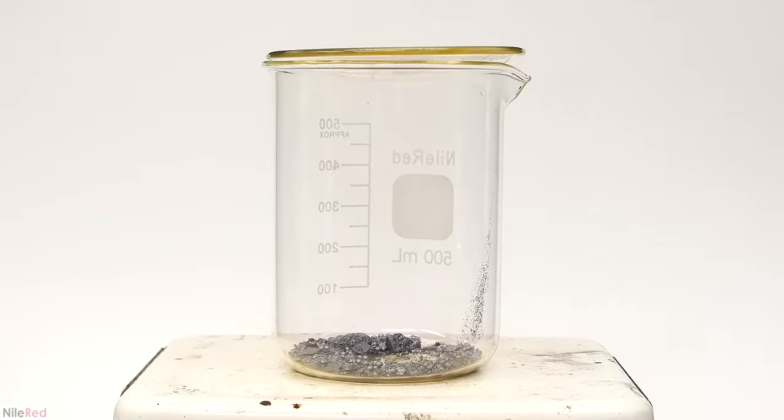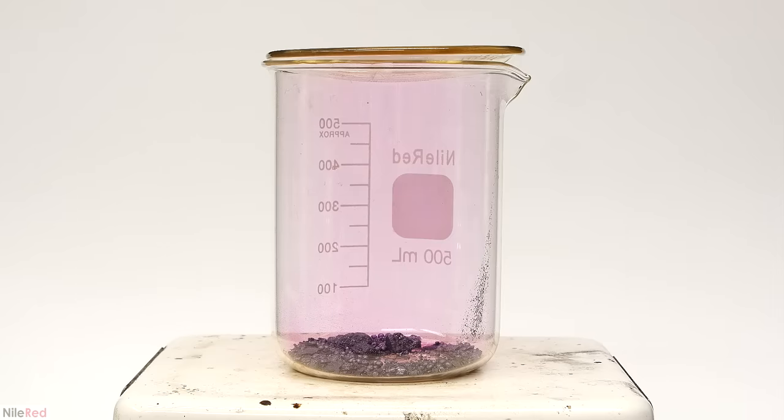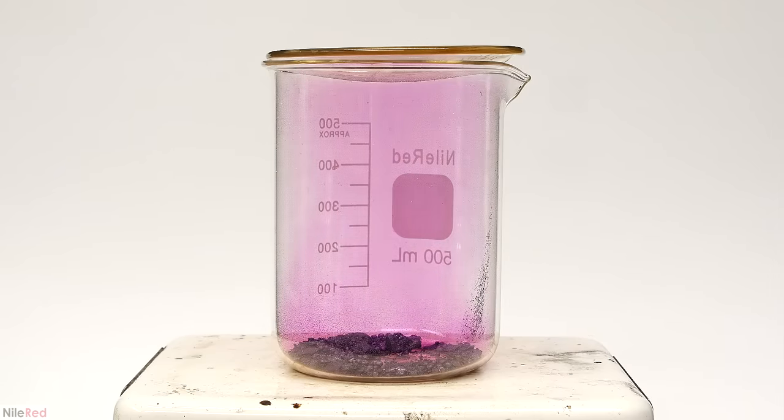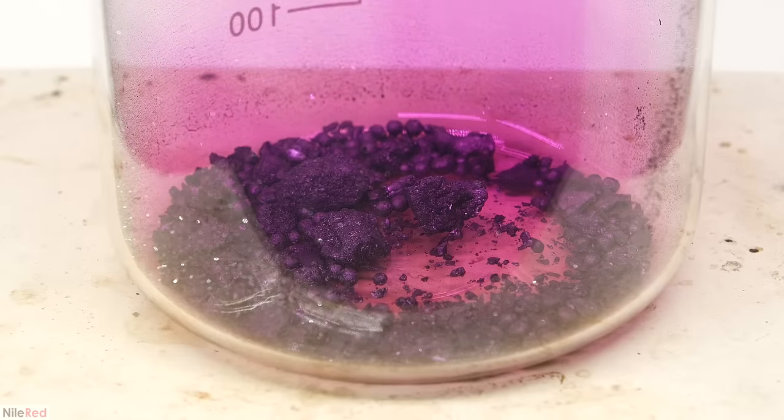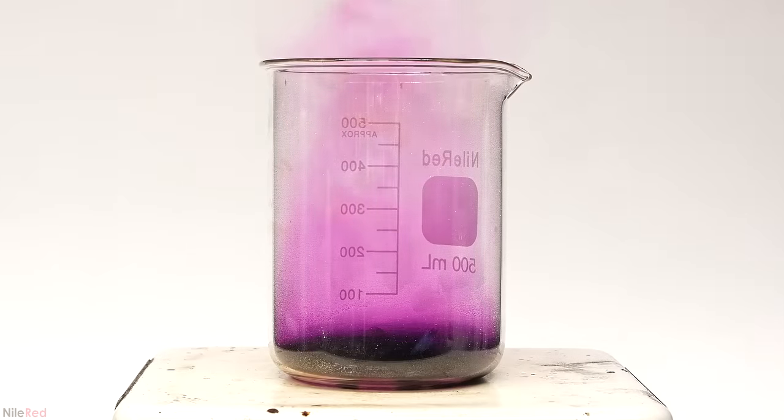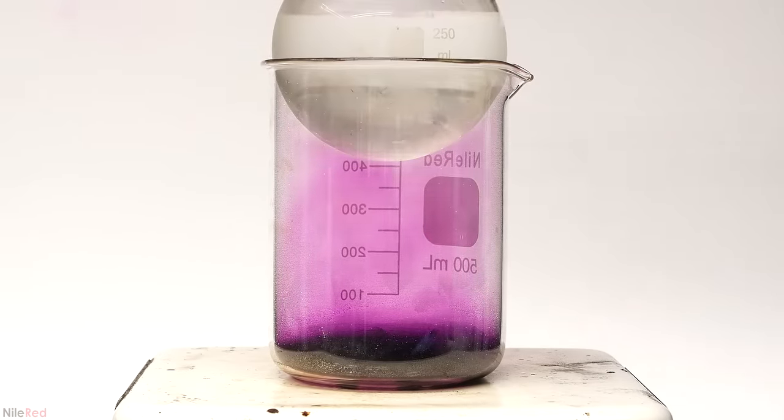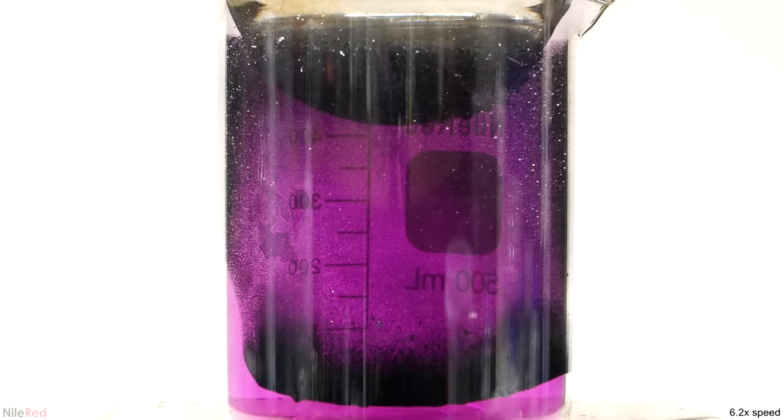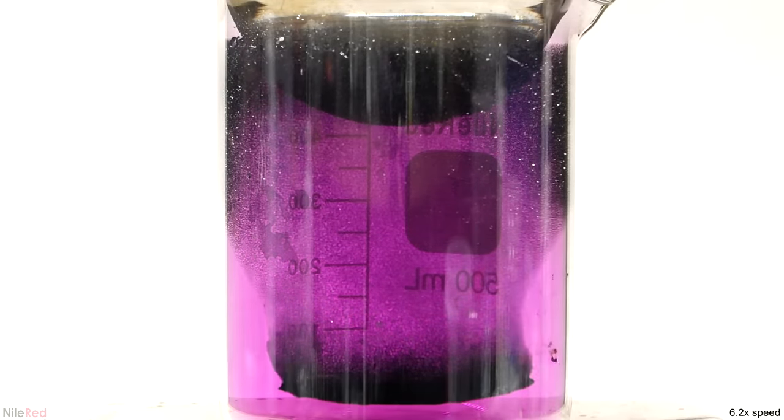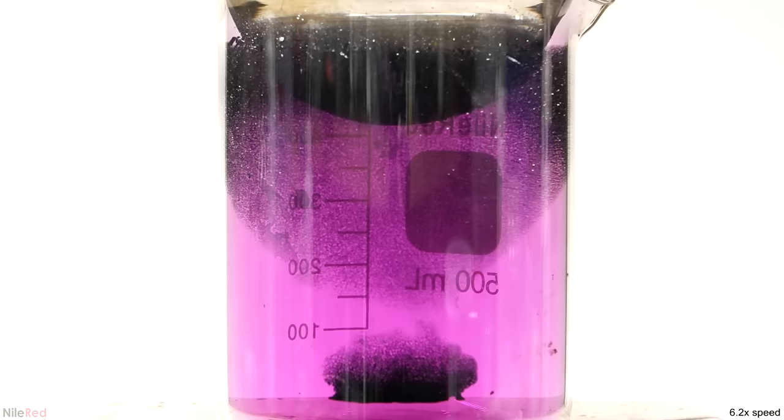As the iodine warms up, more molecules are able to make the transition from the solid to the gas phase, and a lot more vapor is given off. Then, I place a round bottom flask filled with cold water on top of the beaker. The iodine vapors will deposit on this colder surface and reform the iodine crystals.